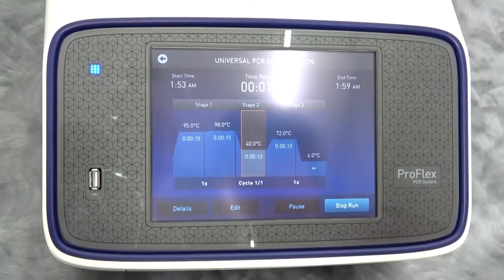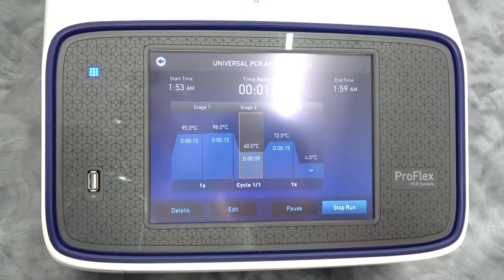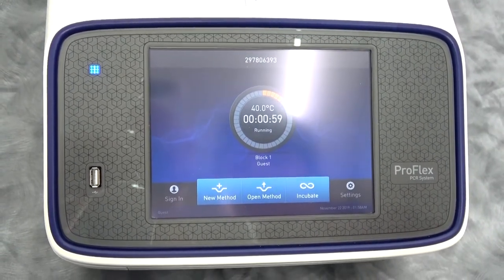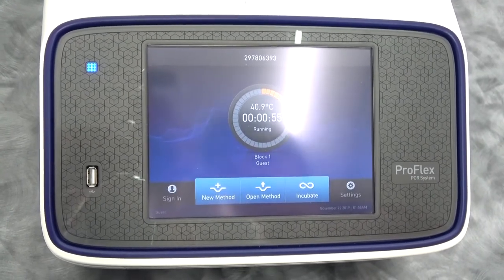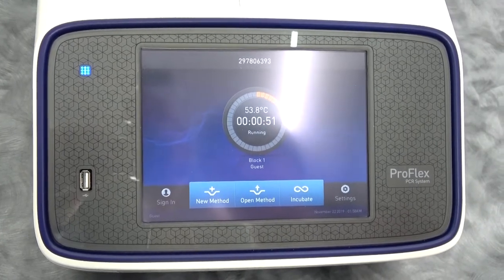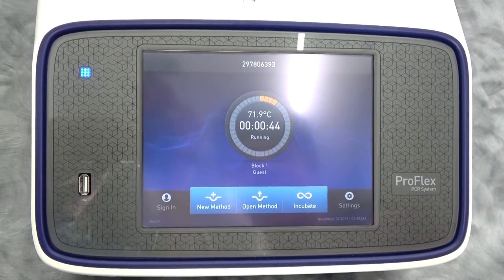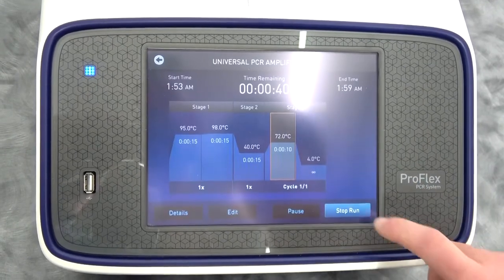We've now entered stage two, which has only one step. I wanted to give you a chance to see this thing ramp up at six degrees per second increments. As you can see, this instrument has plenty of power to do what you might want it to do.